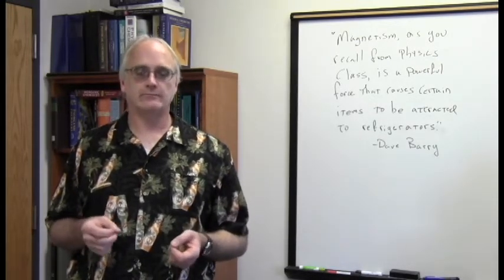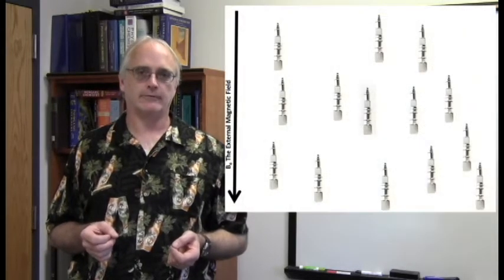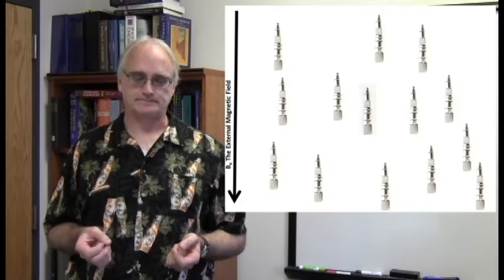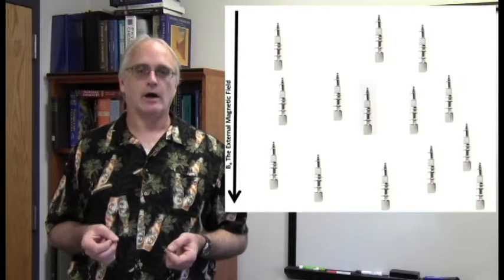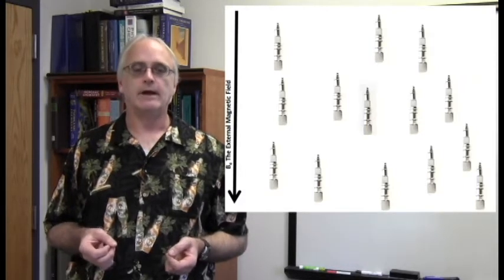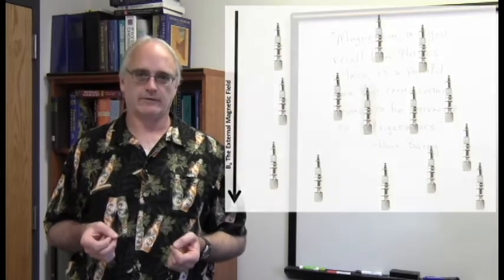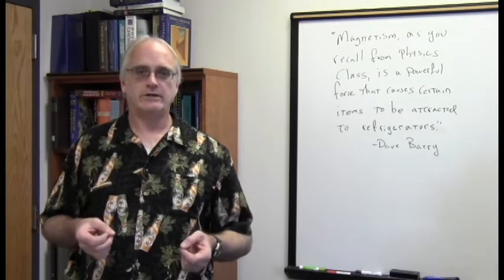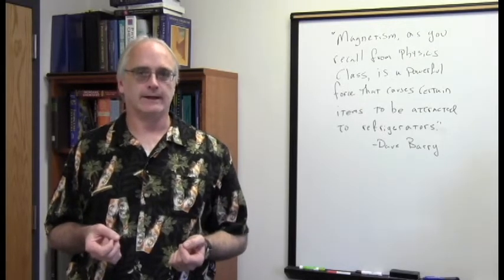And when the external magnetic field shows up, all of our randomly oriented nuclei will change. Of course, they will orient with it, as pictured here. Now we have all of our magnetic nuclei all pointing in one direction. We have now done the basic setup for the NMR experiment, and now it's time to start manipulating the orientations of our magnetic nuclei.